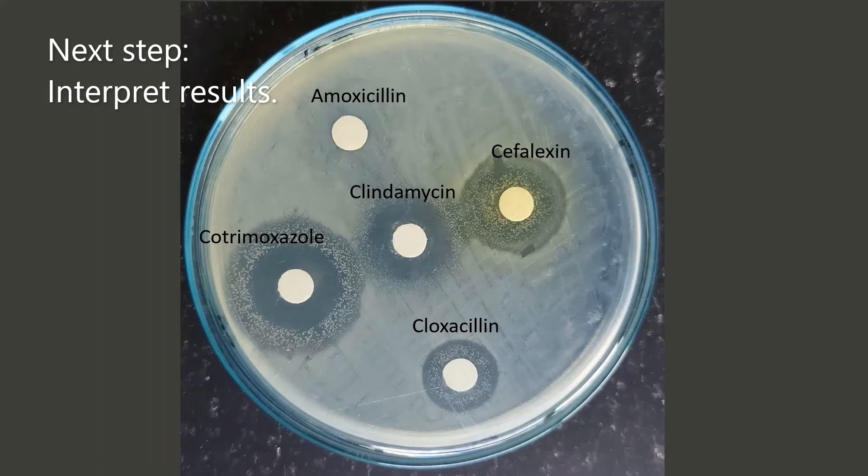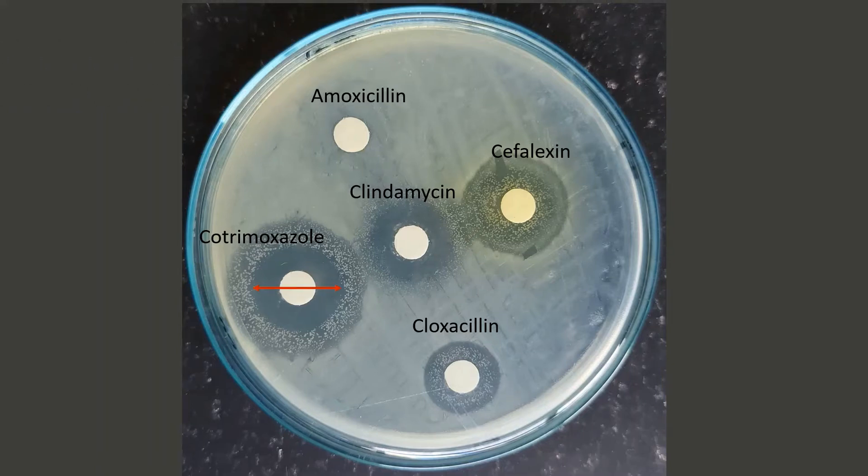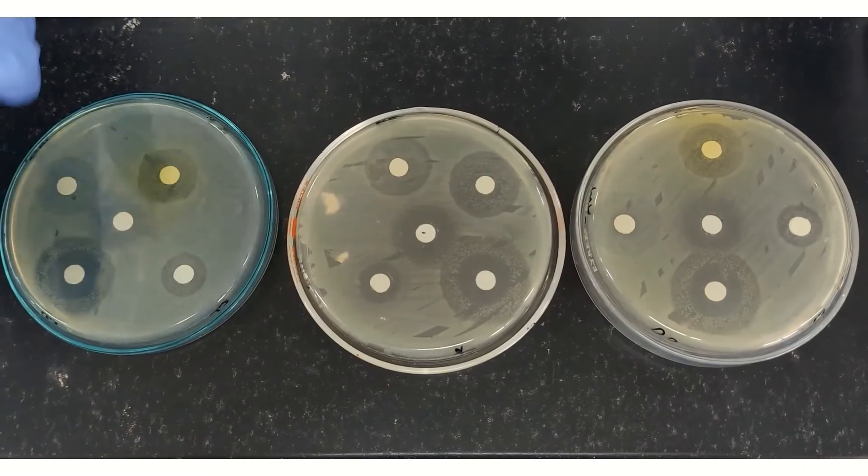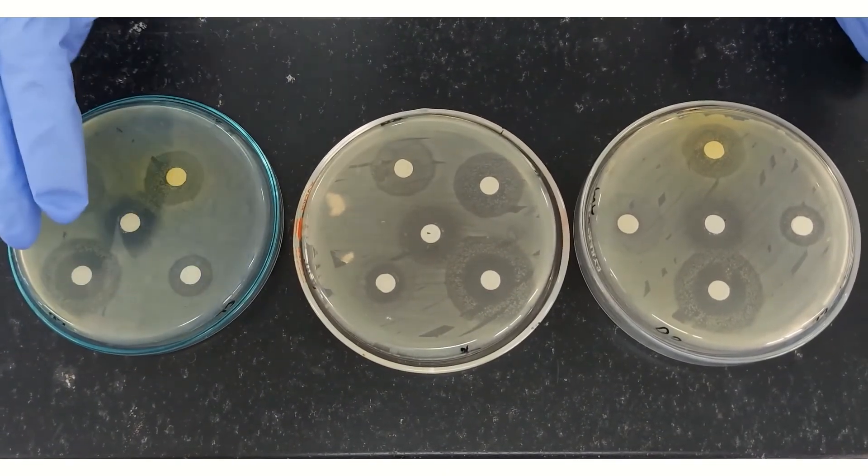Now let's see all our results. Here is the amoxicillin. So what's the meaning of this? Here is a clear zone exerted by cotrimoxazole, meaning that this bacteria is cotrimoxazole susceptible. Amoxicillin did not exhibit zone of inhibition, meaning that this bacteria is amoxicillin resistant. Now if you notice around cefalexin, there are bacterial growth very near the filter paper disc, but somehow you can also see zone of inhibition. These are heteroresistant subpopulations.